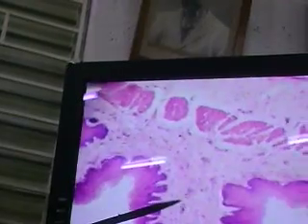That's all smooth muscle that we're looking at right here. Right? Lots of myenteric plexus. Don't see any Meissner's plexus. Muscularis mucosae very prominent, and the lamina propria. Alright, so let's go now to the cardioesophageal junction.